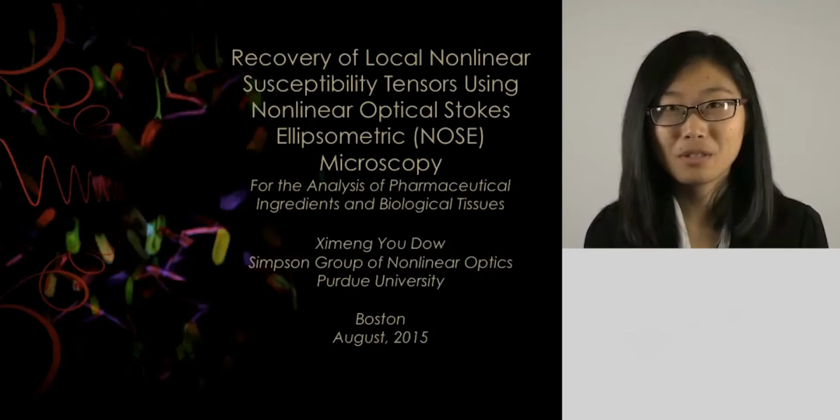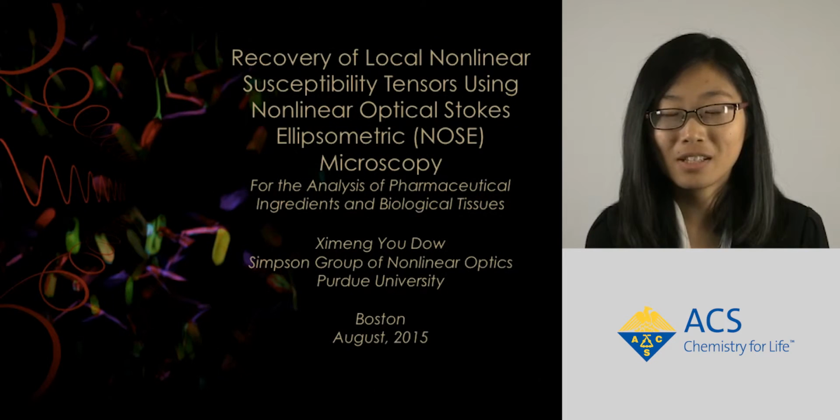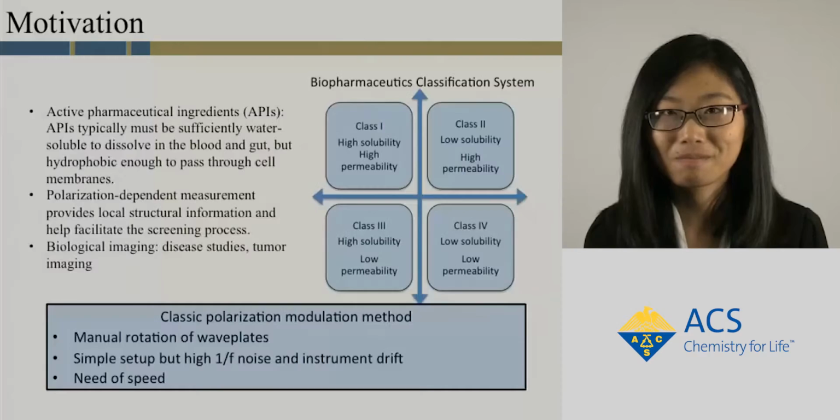Hi, I'm Ximeng from Simpson Lab of Nonlinear Optics at Purdue University, and I'm here today to share with you NOSE microscopy and its application in pharmaceutical analysis and tissue imaging.